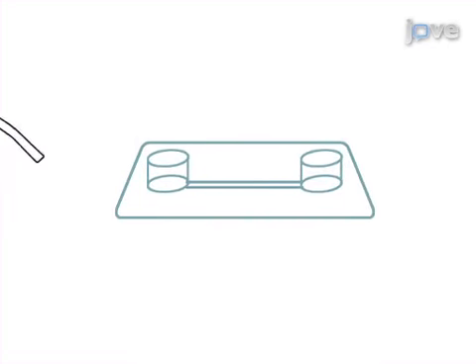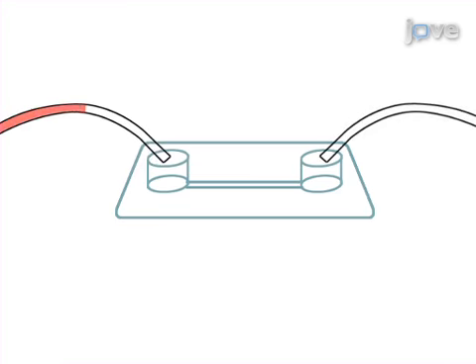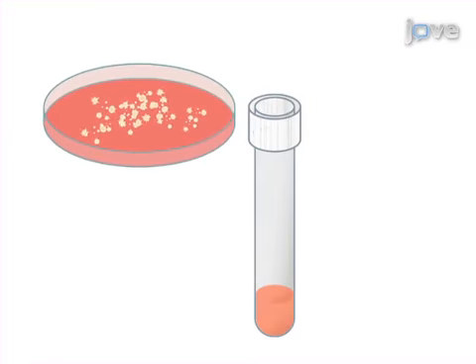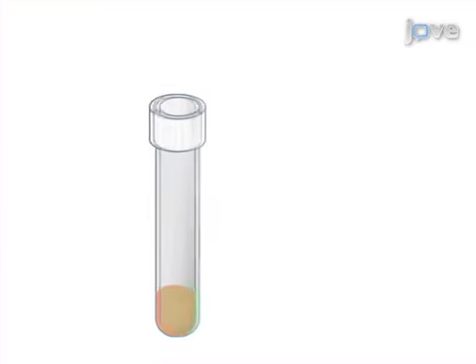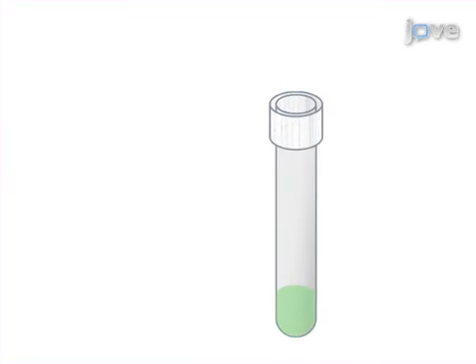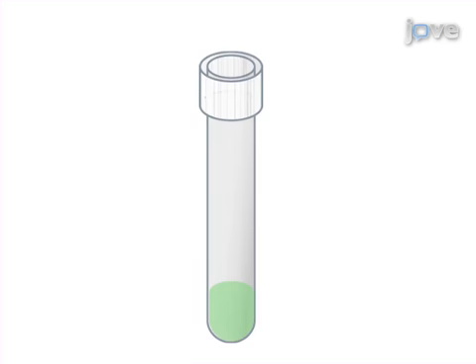The second step is to culture human umbilical vein endothelial cells, or HUVECs, in a dynamic flow system on a microslide with a small channel width. Next, the prostate cancer cells are labeled with an anti-prostate-specific membrane antigen, or PSMA, humanized monoclonal antibody, which gets internalized.